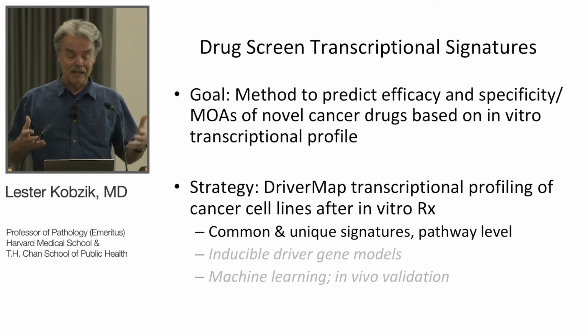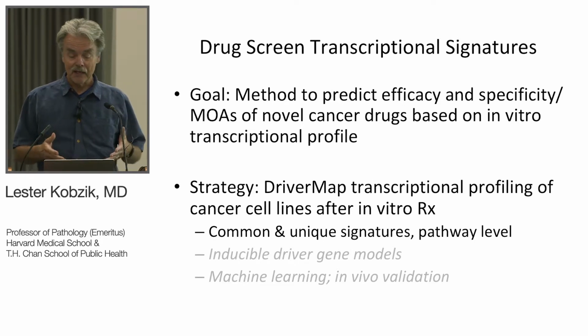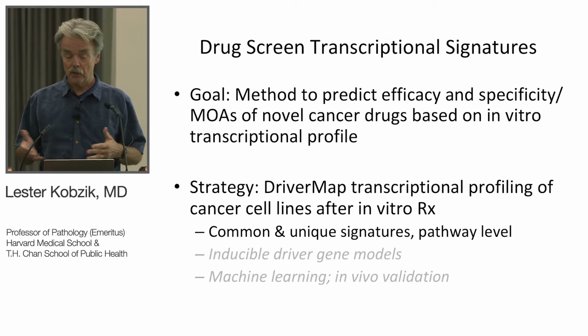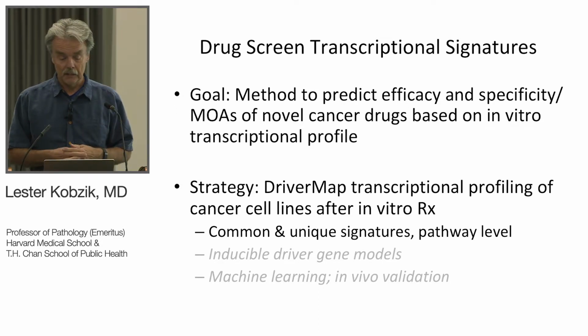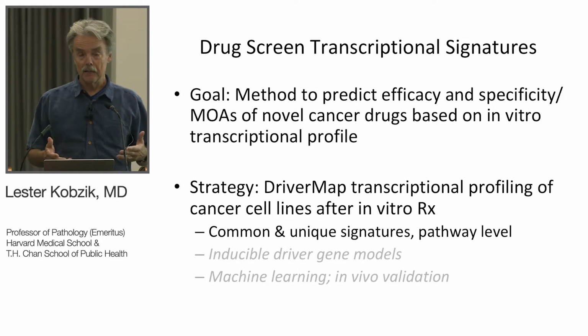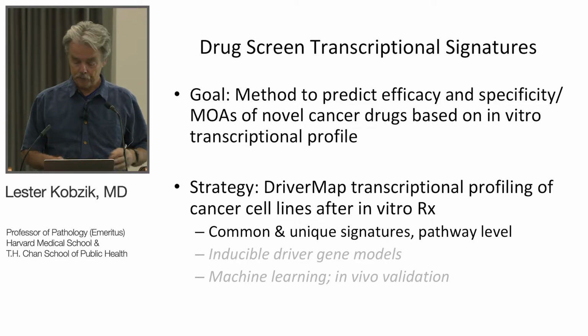And ultimately based on this in vitro transcriptional profile. The specific strategy that I'll share with you is to do transcriptional profiling using the DriverMap platform that you heard about on cancer cell lines after in vitro therapy. And I'll share with you some of the progress we've made in figuring out some common and unique signatures and some data at the pathway level as well.